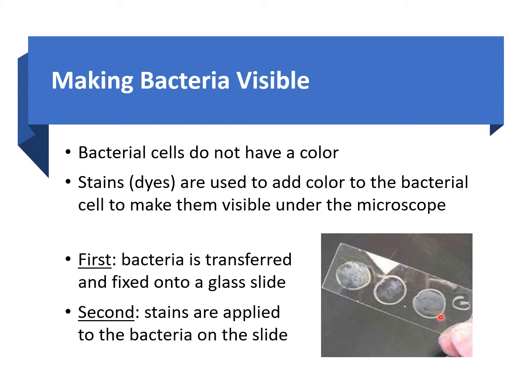It's not recommended to do that, but sometimes if you don't want to have so many slides and you want to save up on your resources, you can go ahead and use one slide and put multiple different samples on it.